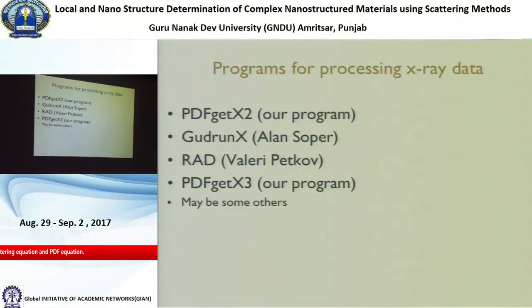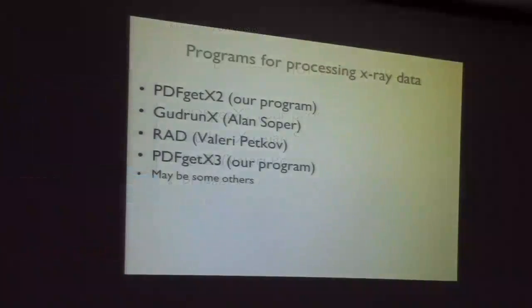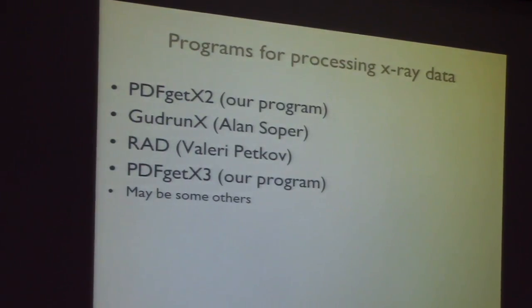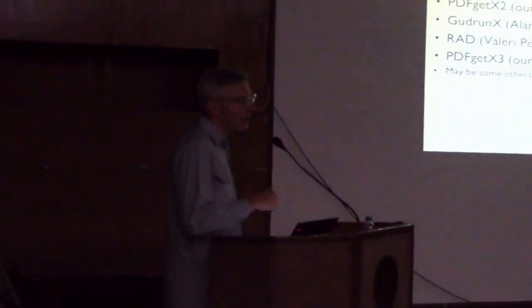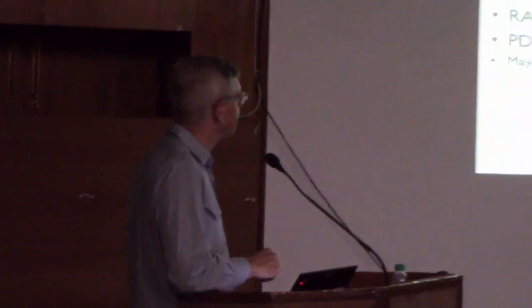All right, so you don't have to read chapter 5 of my book. I recommend actually you don't, unless you're having trouble falling asleep and you need help. Because all of these corrections have actually been incorporated into these programs. It does help if you know a little bit about the corrections, so you know what absorption is and what multiple scattering is and so on.